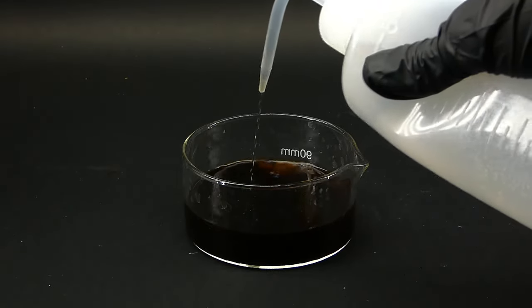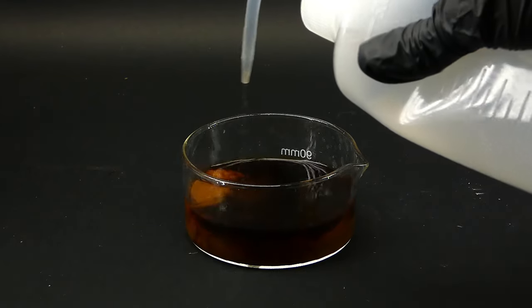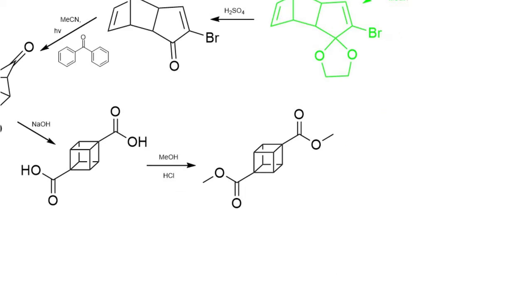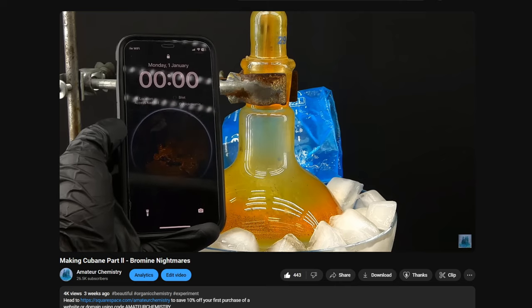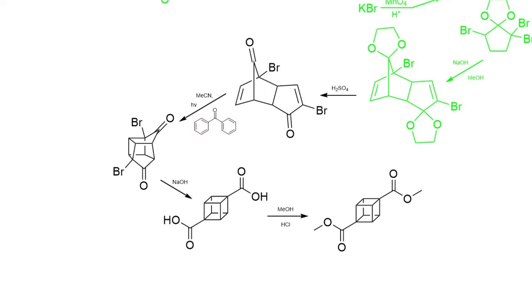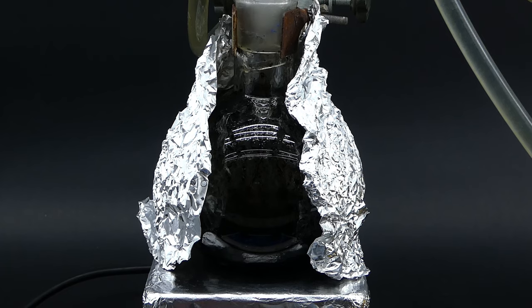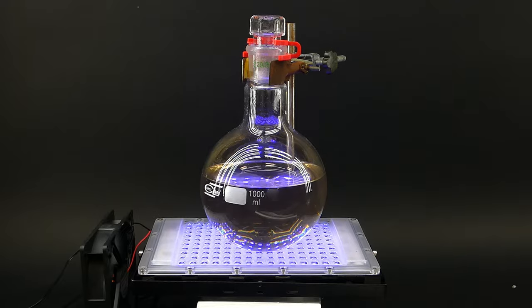Hi guys, welcome to Amateur Chemistry. In this video, I will hopefully be finishing the incredibly long synthesis of Cubane 1,4-Dicarboxylic Acid Methylester — the funny cube molecule — which I started a long time ago, and after 2 videos only got the first half done. The second half should be way less intense, but taking into account everything that happened and the weird reactions I'll have to carry out, I can't really be sure of that.